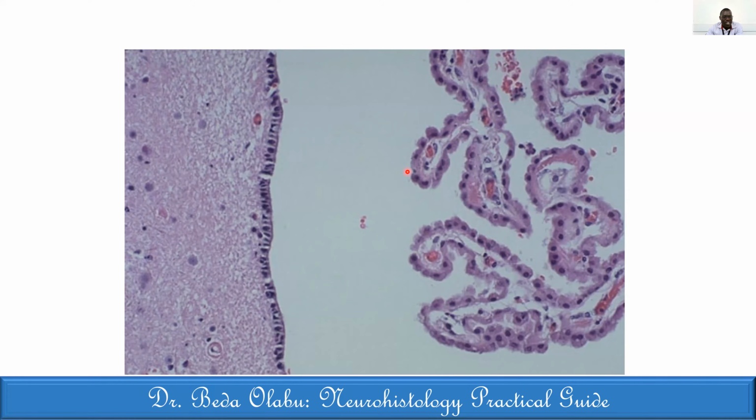Okay, sounds difficult for the majority. So look. All right, Raymond wants to try. Yes, Raymond. The choroid plexus or something. Yes, actually, you're right. This is the choroid plexus.